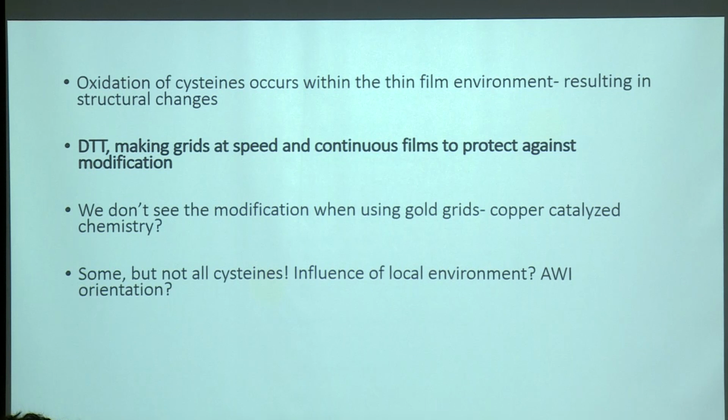We haven't seen this modification apart from on surface exposed cysteines, but we don't see it on all cysteines all of the time. So there clearly is an impact around local environment there, which is interesting. And we've also seen other residues become modified at this point. So really, there's some really interesting things going on here.